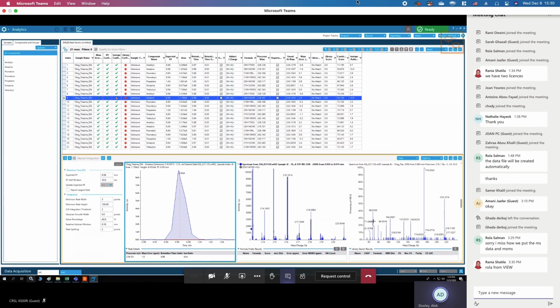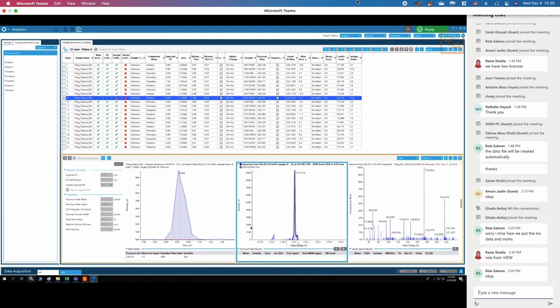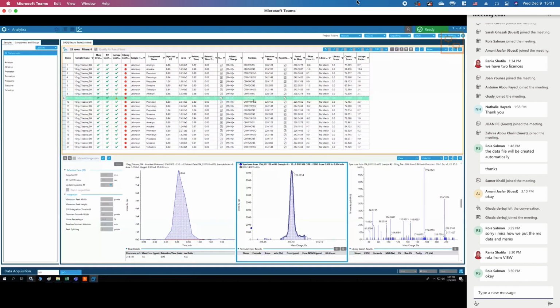And the same thing, this is the MSMS spectrum that was taken from this peak, also only at the red line. And you see some overlay here. Now the overlay is pretty good. Let's zoom in. You see the gray? The gray is the overlay, and that is the isotope ratio of this compound. So this compound, here's the formula, C8H14ClN5.